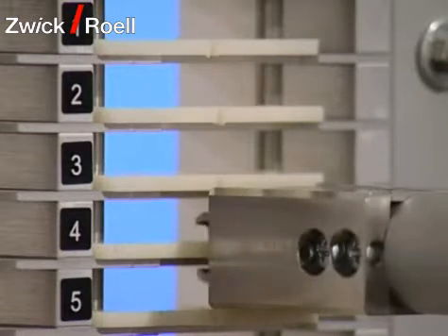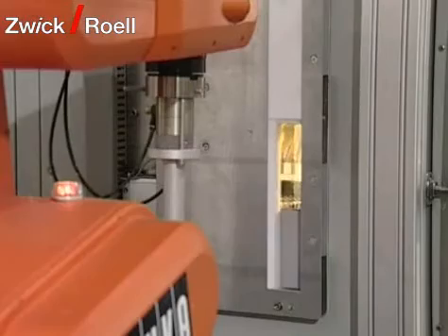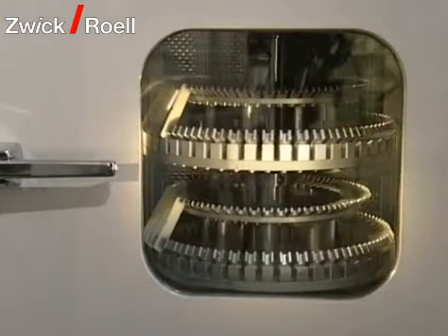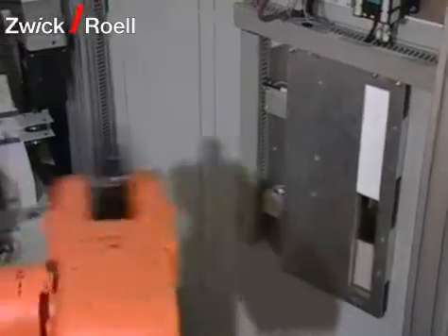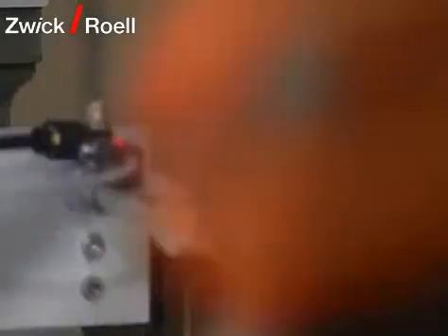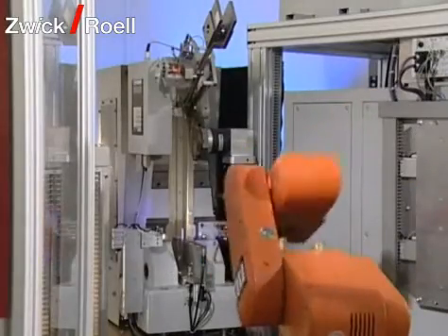Once the required temperature in the temperature chamber has been reached, the robot places the specimens from the interim magazine in the temperature chamber. Once the specimens have spent the pre-set time in the chamber, the polar robot takes them out and they are tested with the Izod pendulum impact tester. Testing takes place within five seconds after taking the specimen out of the chamber.